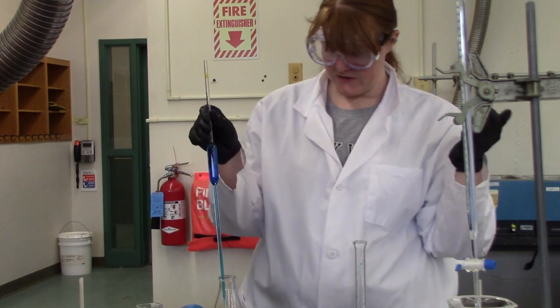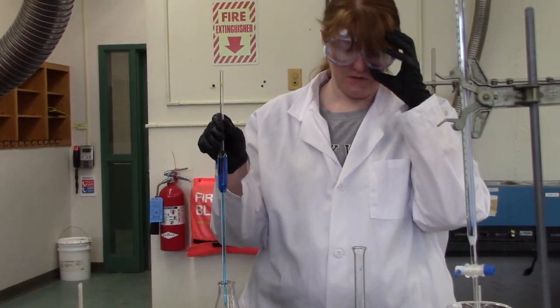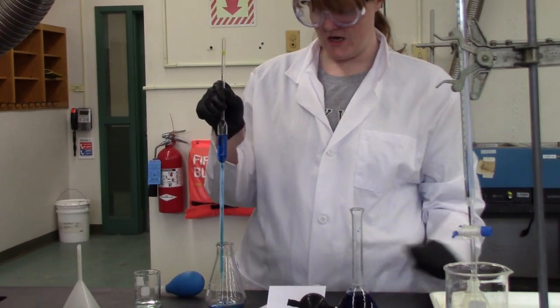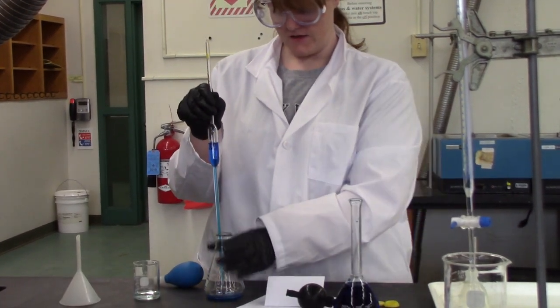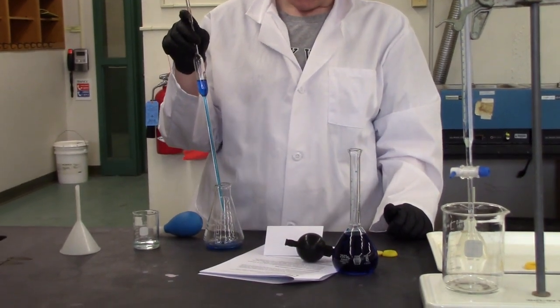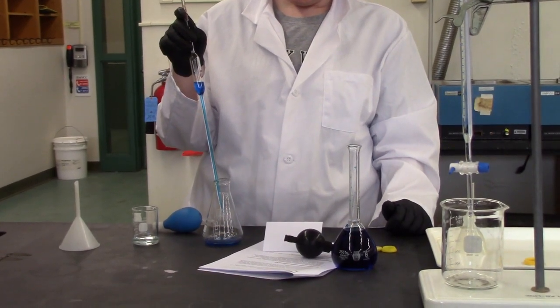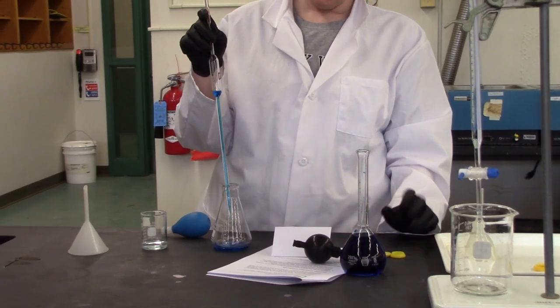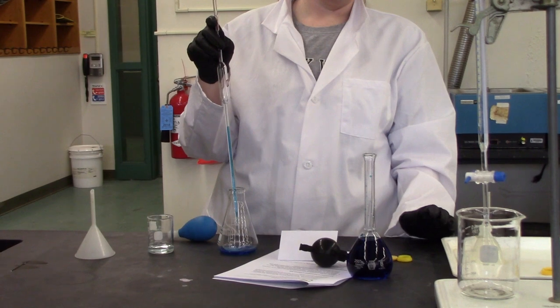Then you remove your hand and you just let it drain into the flask that you're going to use for your measurements. Erlenmeyer flasks are ideal for this because they prevent splashing from being too bad. Everything drains back down to the bottom. So I'm going to let the pipette drain. And once it's finished, there's going to be a teeny bit of liquid stuck at the tip that's supposed to be there. Don't blow it out, okay?